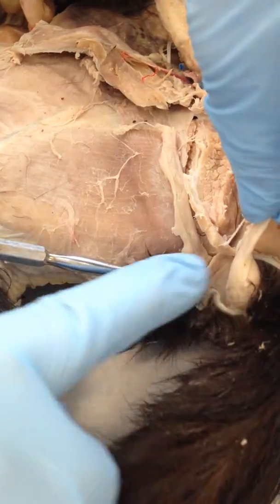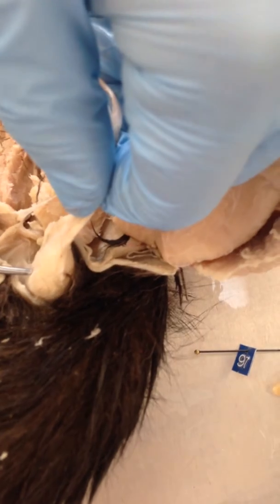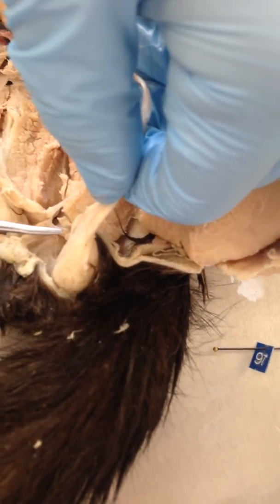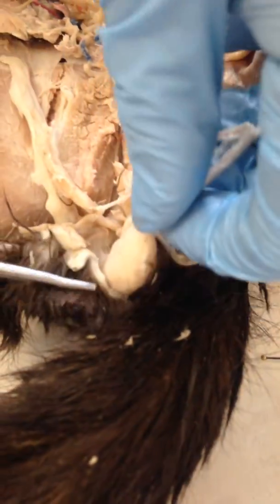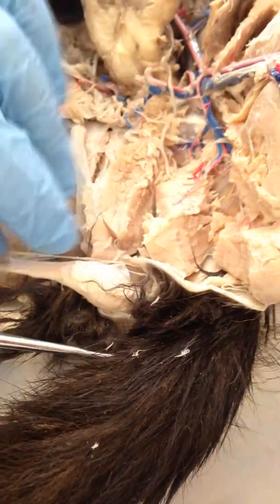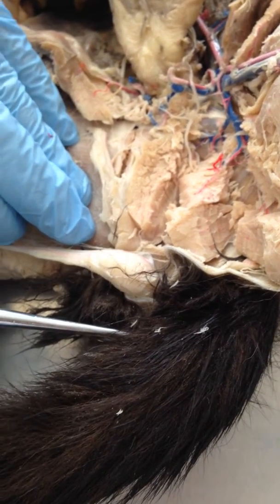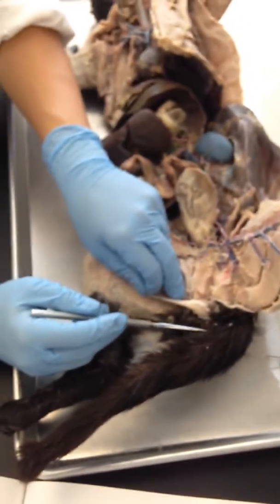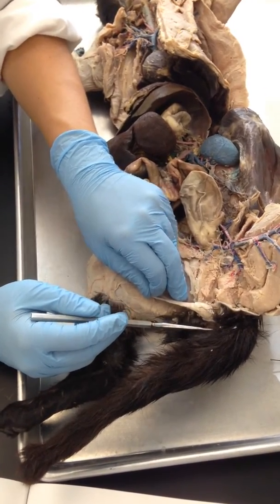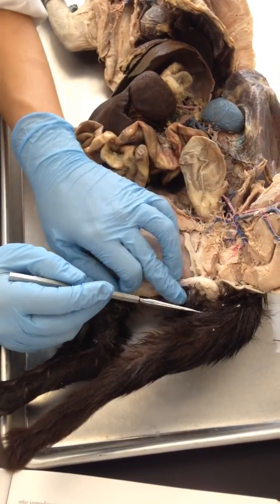And that's what this is. These two are layers, the tunica vaginalis and the tunica albuginea. Both of these are this one thing? Yes, they're together. How do you distinguish between the two? We're not gonna worry about it. But they surround it there, so as it says, the fibrous coat of the testis proper is this. And this is the peritoneal covering. They're subtly different, but I can't separate them.